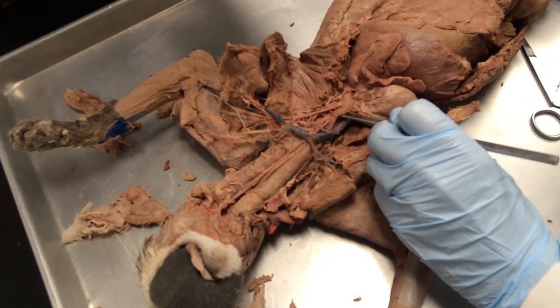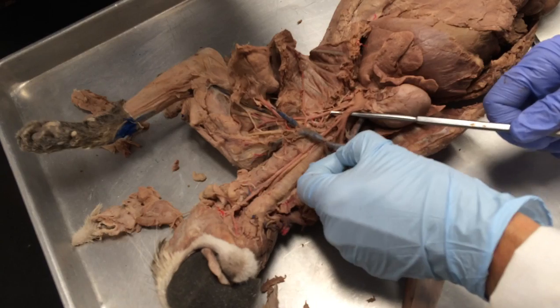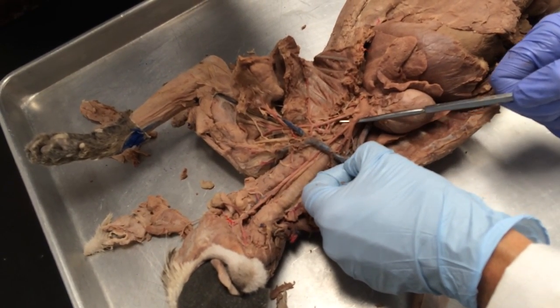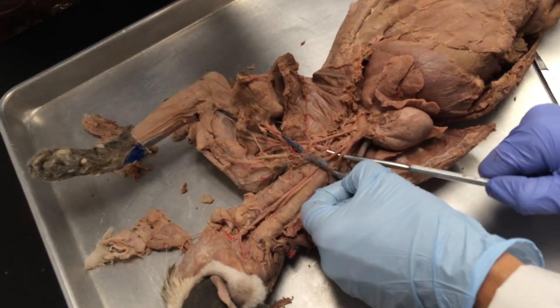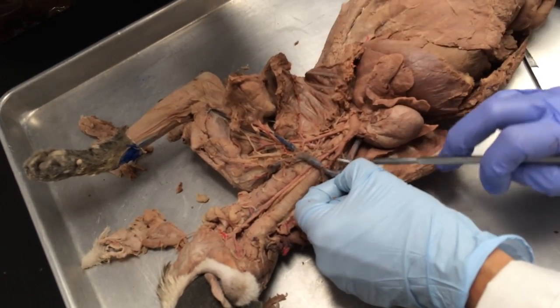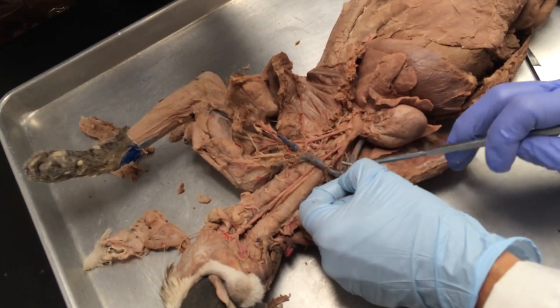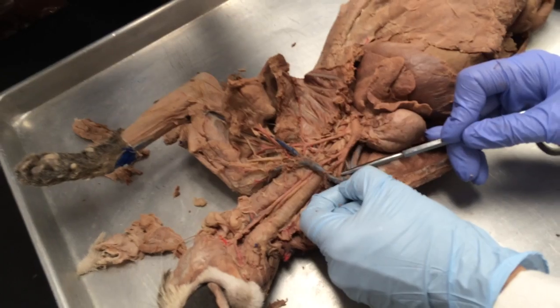Okay, now we're coming back here to the brachiocephalic. The brachiocephalic has three branches coming off of it, and this is where you sometimes get varieties, variants. So typically those first two branches are the right and left carotids. So here is the right carotid, that's the left carotid, and here's the right carotid. The next branch is the subclavian, okay?